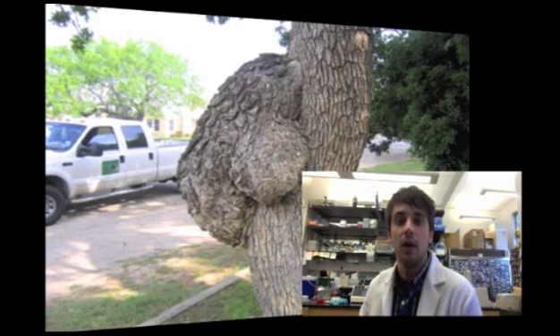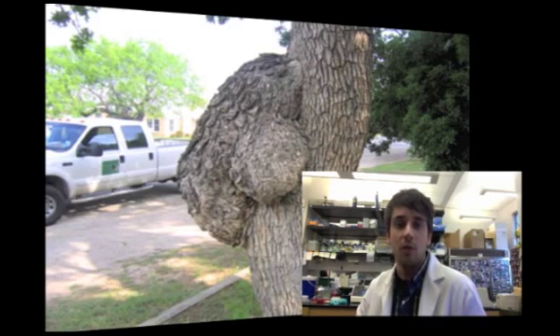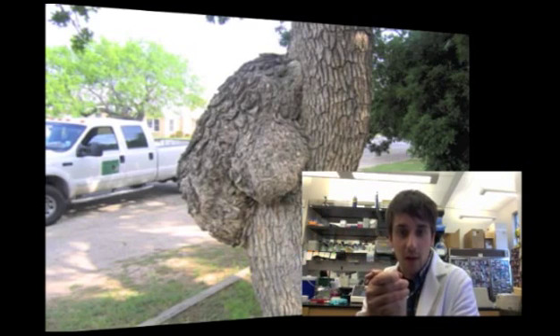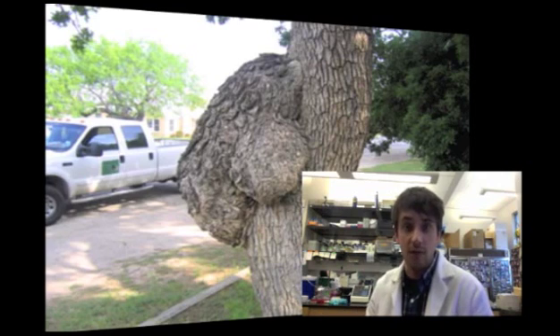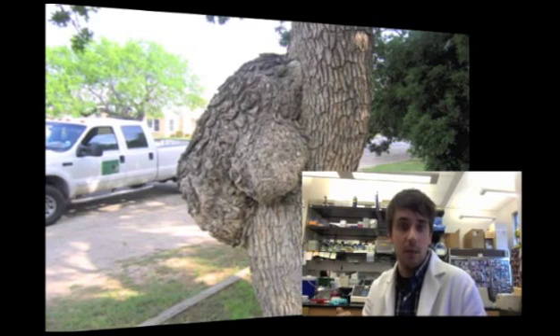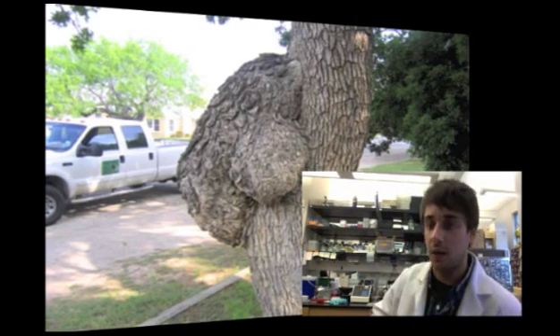First thing we need to do is get it into agro, so we're back to the same problem. How do you get DNA within the cell? For agro, it's actually pretty simple. We're going to shock it. You mix some DNA, the kind that we had in our tube over there, with some bacteria. When you shock the bacteria, the little cell will open up really quick and then close again. Hopefully if our DNA is close enough, it will sneak inside after we shock the bacteria. Then from there we can grow it up, inject it into a plant, and hopefully it will inject it into a cell and we can see our protein. So let's finish this process up real quick and show you guys how that works.